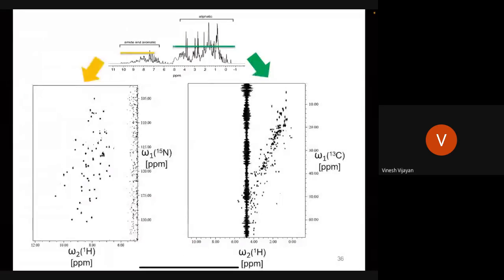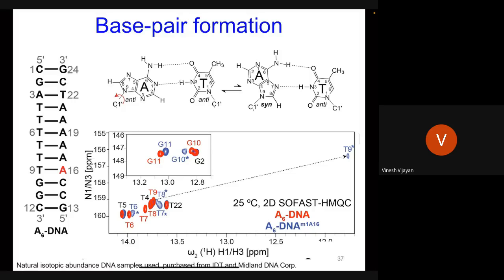So what people are able to do is to resolve them into two-dimensional NMR experiments. So although protons occupy a similar space, the other dimension, which is orthogonal, in terms of carbon or nitrogen, helps you get very beautiful resolution. Without stealing much of the content from Jeet, I'll stop right here. And this could be used for studying biomolecules.